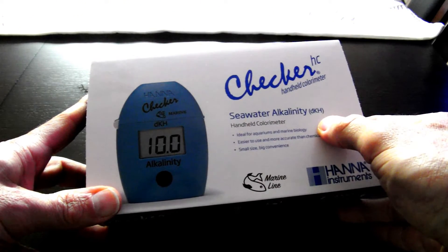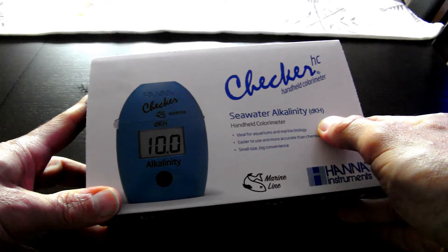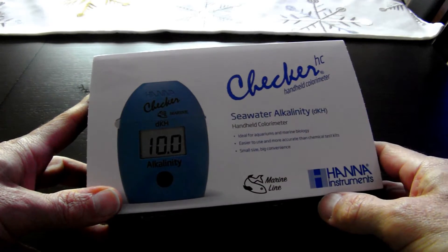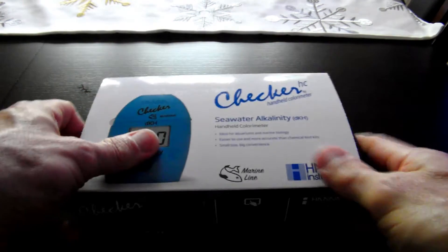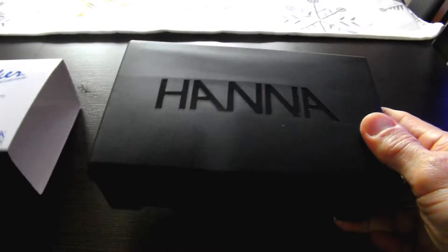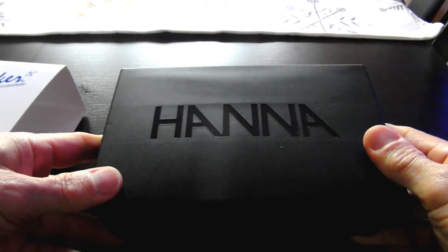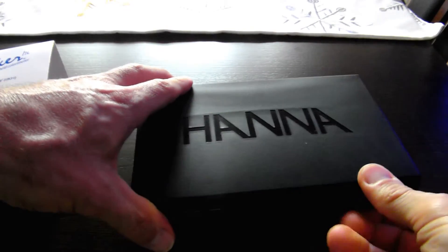It's a reading that seems like most reefers look at nowadays as opposed to the other version of this particular unit. So let's open it up and see what we got. It comes in a pretty solid plastic case for storage.